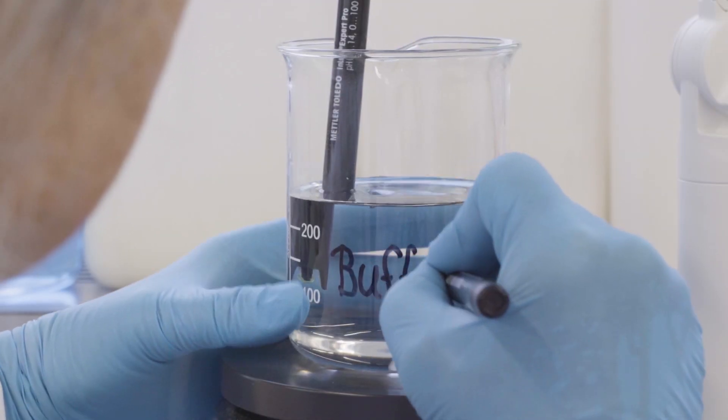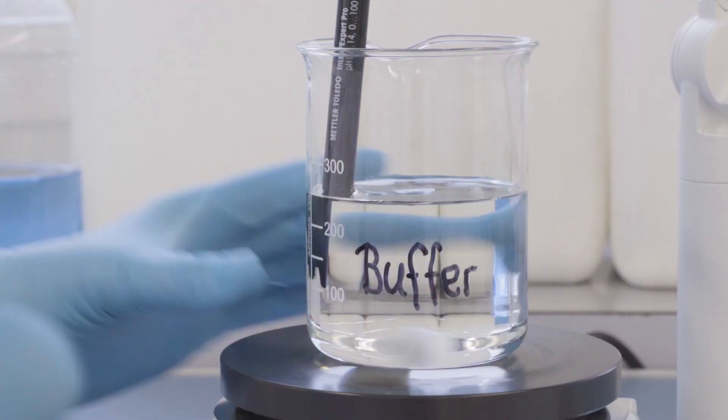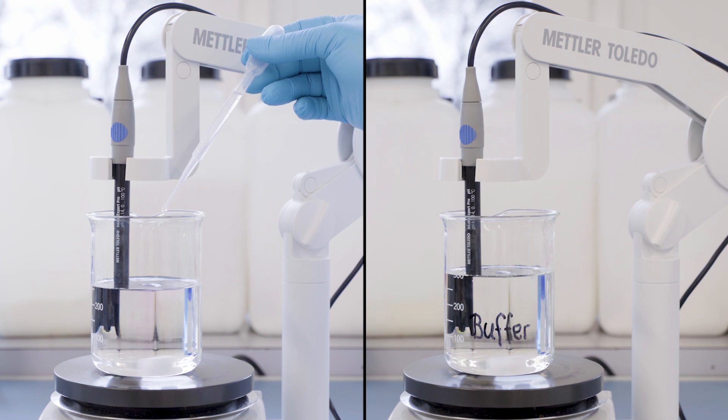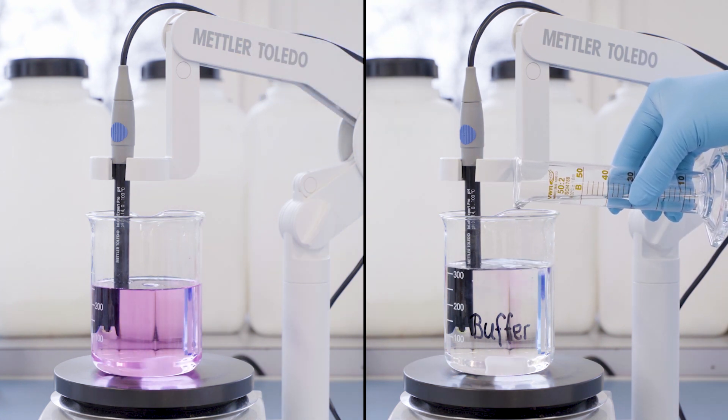Buffers ensure the pH of a solution remains stable. They are widely used in chemical and biochemical analyses as well as in many products. When an acid or an alkali is added to a solution, the buffered solution resists pH changes.